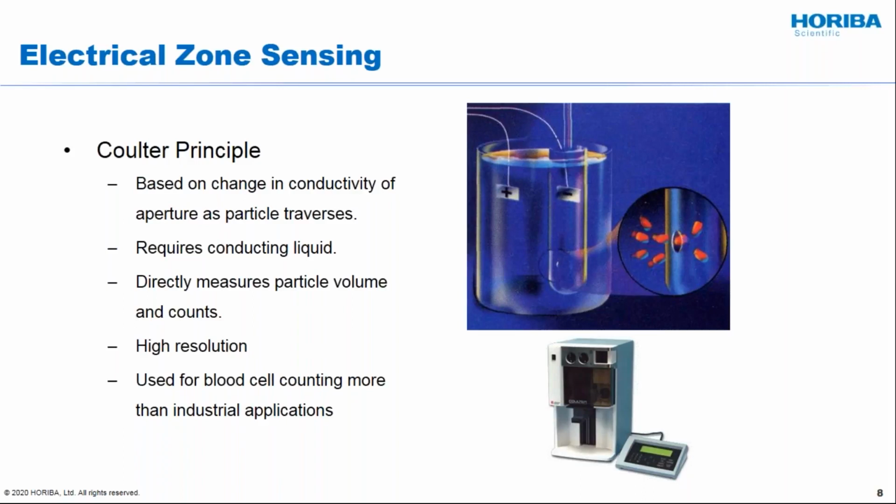So again, you're going to have this in a conductive liquid. You're going to need to have this well dispersed because you don't want these particles sticking together as they go through the orifice. So each of the techniques we'll talk about has certain pluses and minuses. There is no perfect technique out there that can handle every single type of sample.